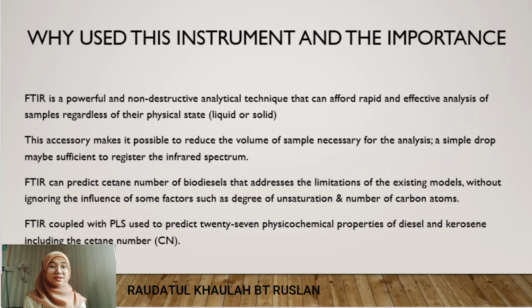Why use this instrument, and its importance? FTIR is a powerful and non-destructive analytical technique that can afford rapid and effective analysis of samples regardless of their physical state, whether solid or liquid. This accessory makes it possible to reduce the volume of sample necessary for the analysis. A simple drop may be sufficient to register the infrared spectrum.